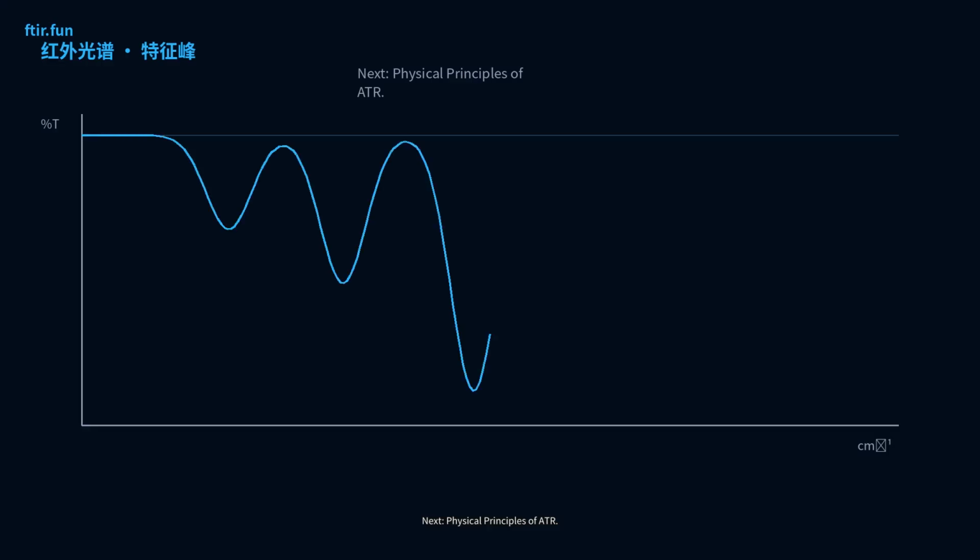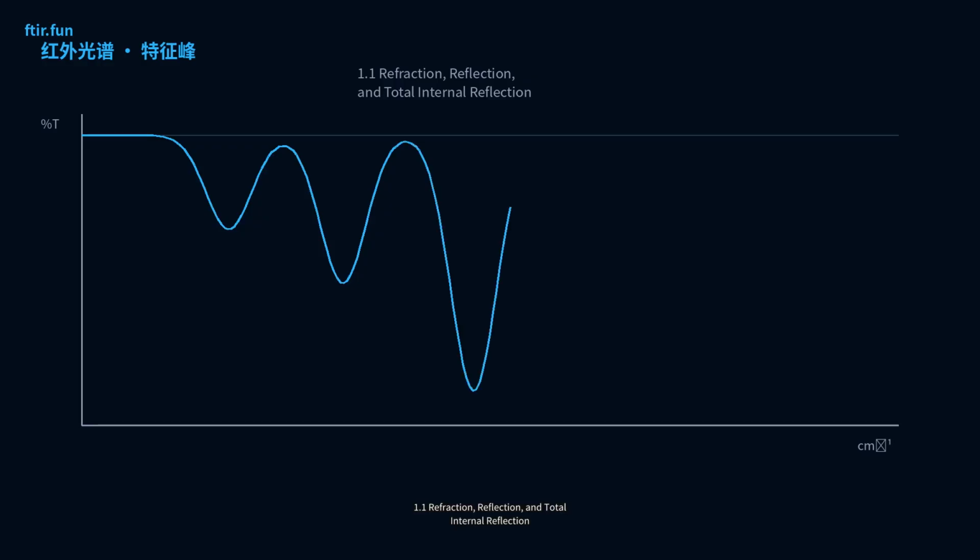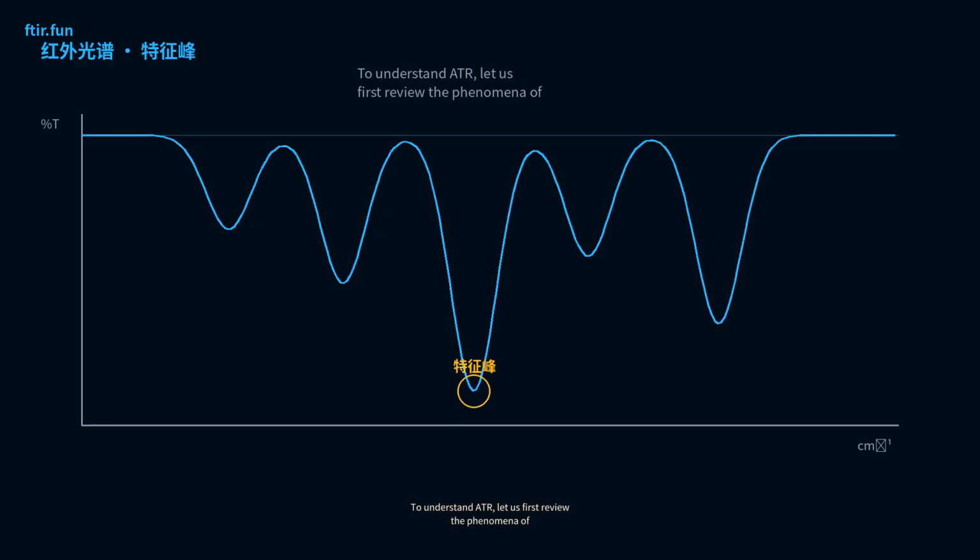Next, physical principles of ATR. 1.1 Refraction and total internal reflection. To understand ATR, let us first review the phenomena of refraction and reflection of light.